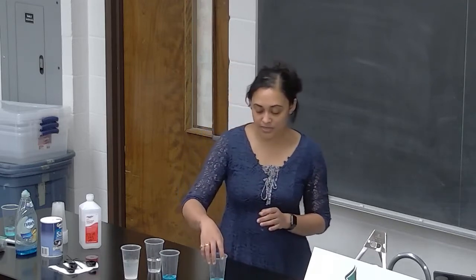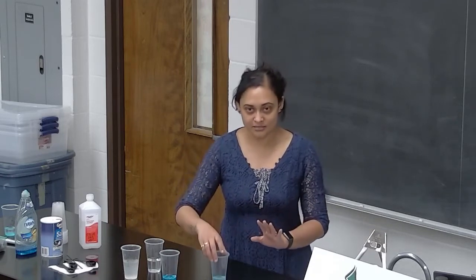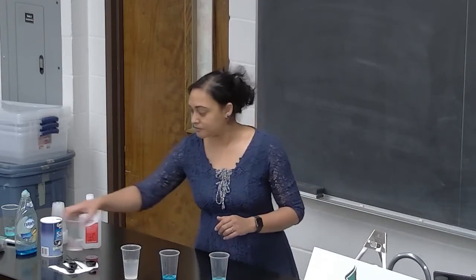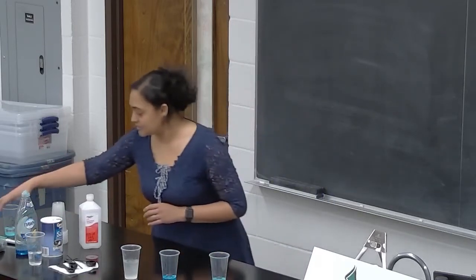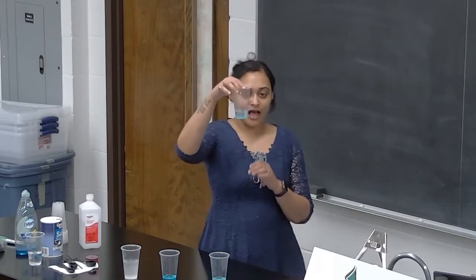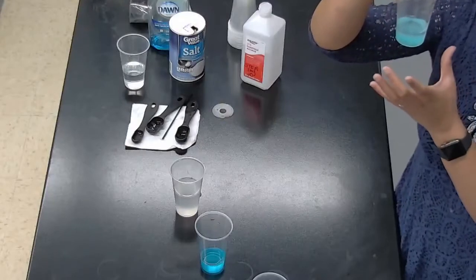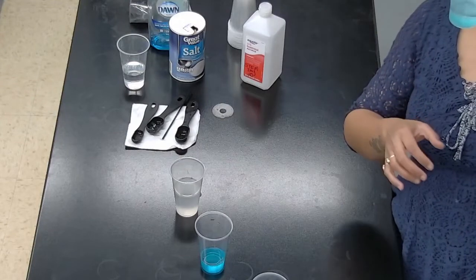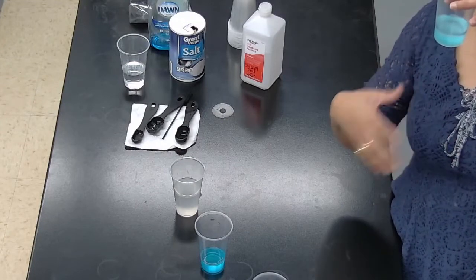So we keep this aside for a minute for the DNA to clump together so that we can see it isolated at the bottom of the alcohol, where the alcohol separates from the solution. This experiment I already did earlier, so you can see the clouds of DNA. The longer we leave it, the more DNA accumulates.